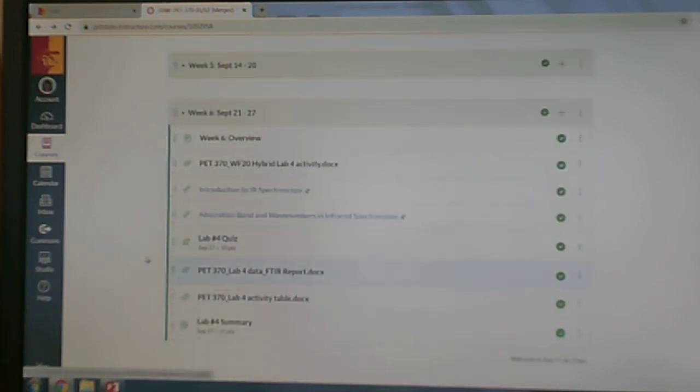So after you've looked at your lab activity, we have two videos on Introduction to IR Spectroscopy and then Absorbance Band and Wave Numbers in Infrared Spectroscopy. And so with the overview, this video, and these three items, you should be able to complete your lab number 4 quiz.